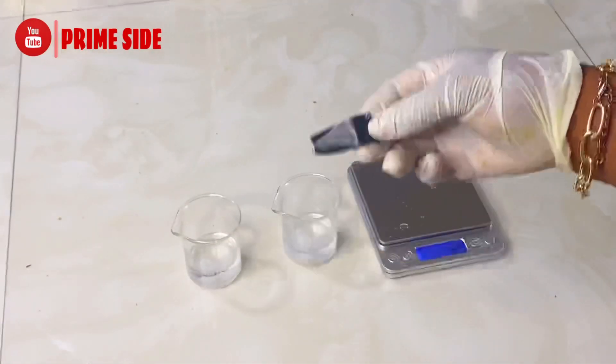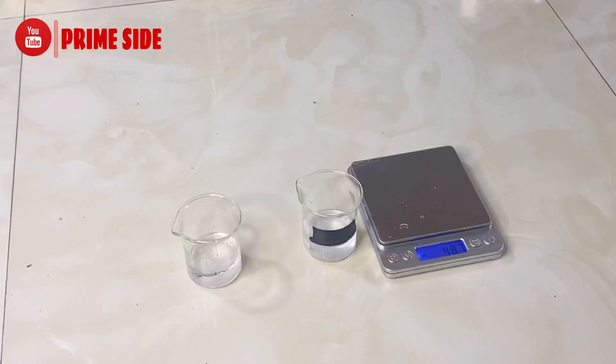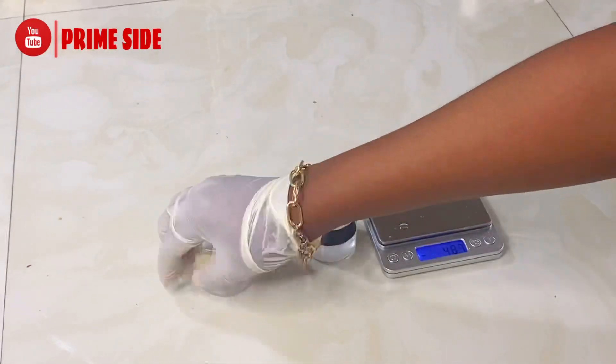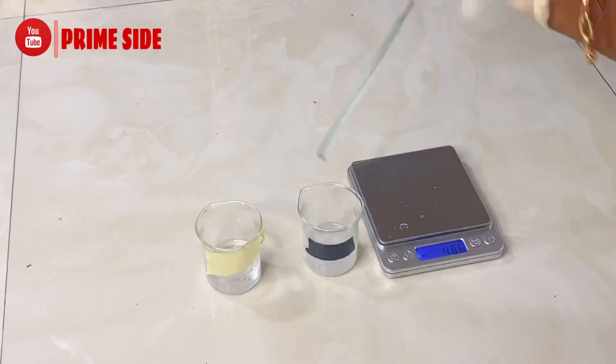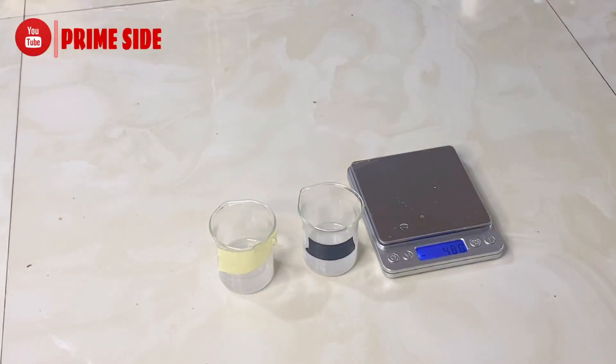In order to identify them, I'm going to use a black masking tape on the beaker for propylene 1,3, and on the other hand I'm going to be using a paper masking tape for the beaker containing propylene glycol. I'm just going to stir the solution and then leave it for 10 minutes.